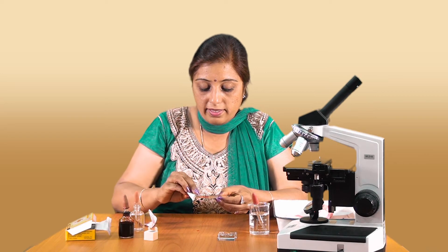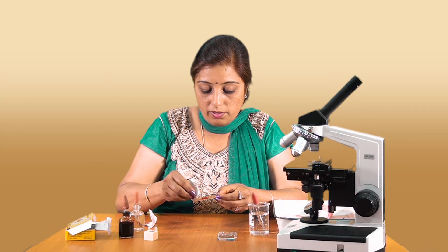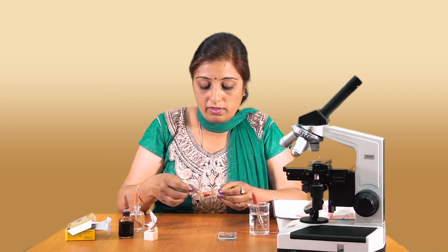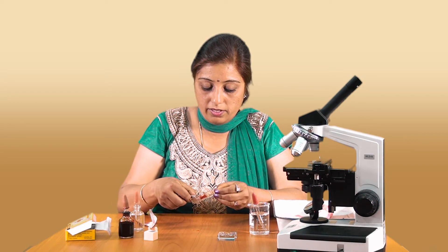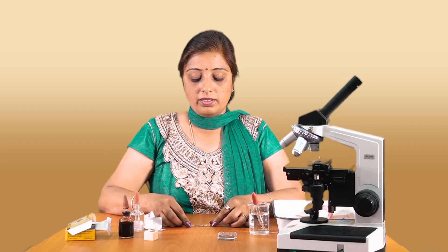Before placing the slide on the microscope, I am wiping off all the extra things that have got deposited on the slide. Now the slide is ready for the observation.